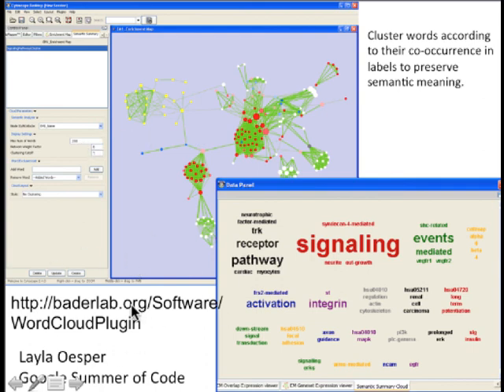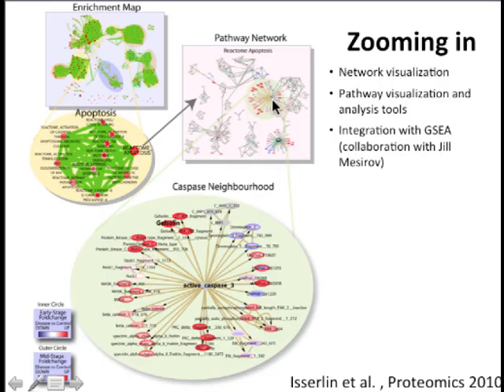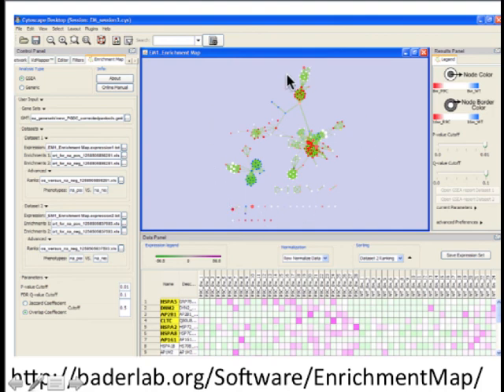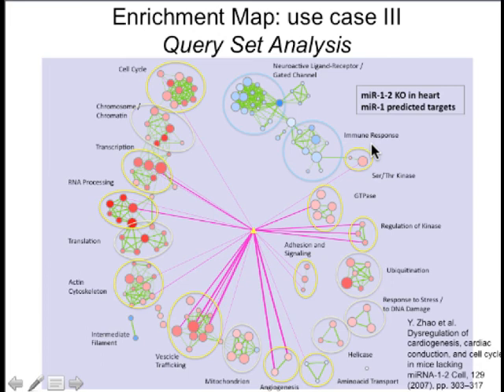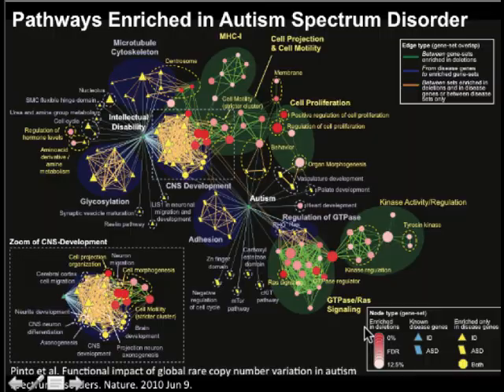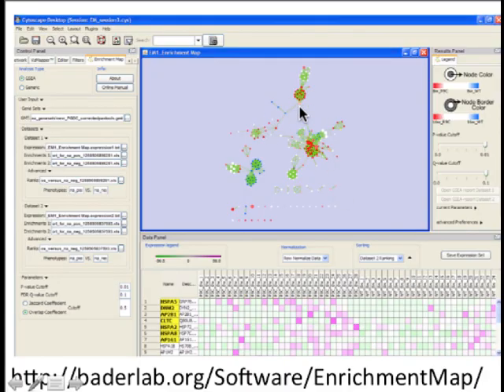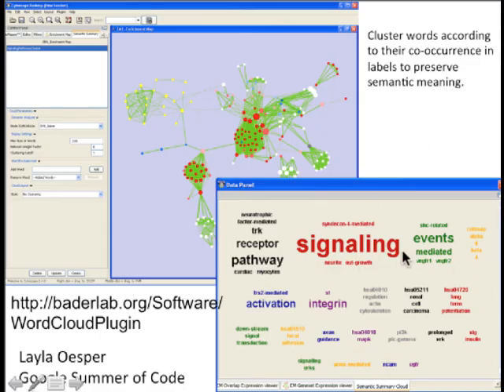There are also additional apps available. There's a word cloud app that helps summarize the theme — by default, Enrichment Map gives you the map without the grouping bubbles. Now we have a system called Auto Annotate that automatically adds those bubbles and automatically chooses a label for the bubble based on the names of the pathways it groups. You can also look at the frequency of different words across a group of pathways using the word cloud app, which might give you a better name for some annotations. We'll go through that in the lab.